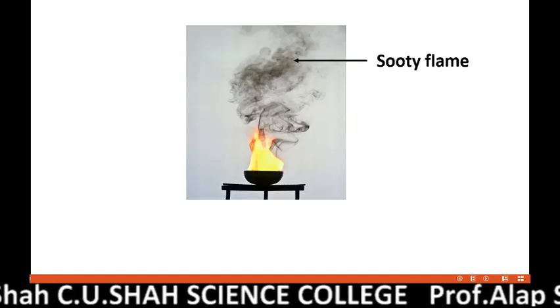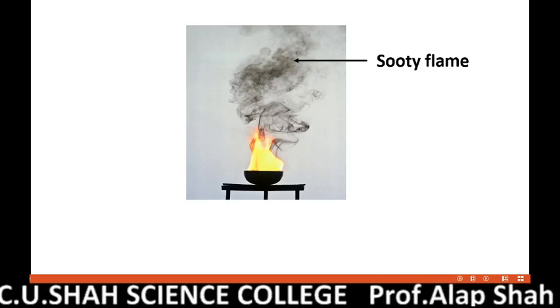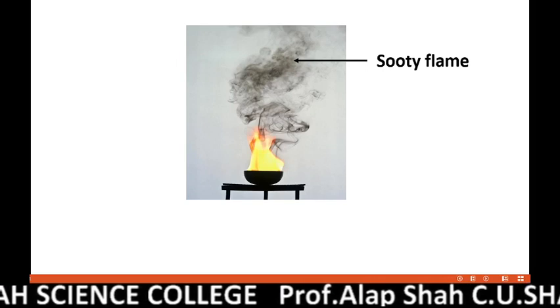So these tests are known as preliminary tests. Now in a forthcoming video, we will discuss the other tests of the qualitative analysis of the organic substance.